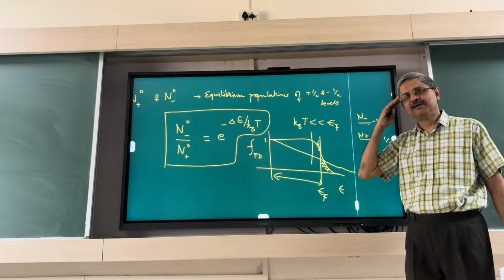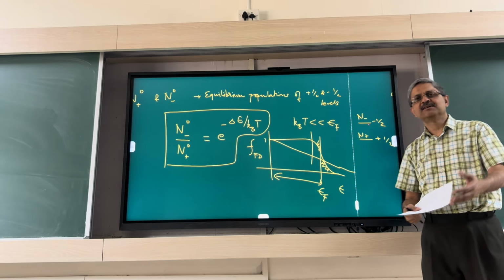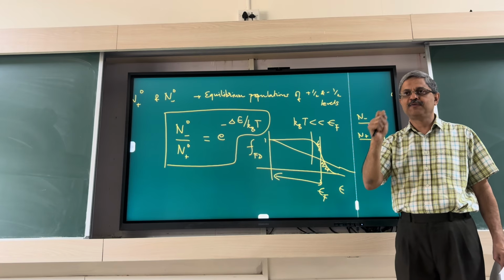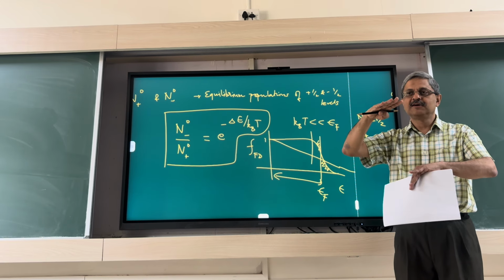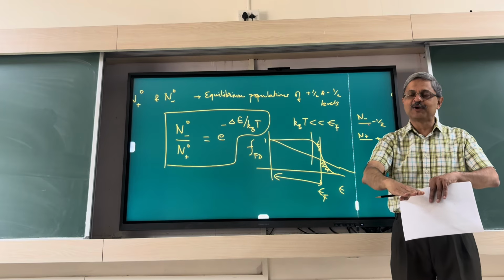Quantum mechanically one works out the problem. Have you heard of this thing called Rabi oscillations? That's exactly what will happen. If you have the two levels and you continuously have the RF field on, you will excite nuclei and get a population inversion, and with time it will go the other way and you will get all the population back in the ground state.